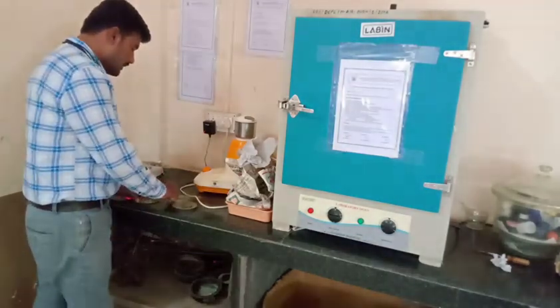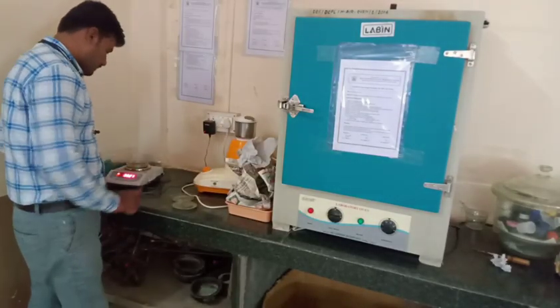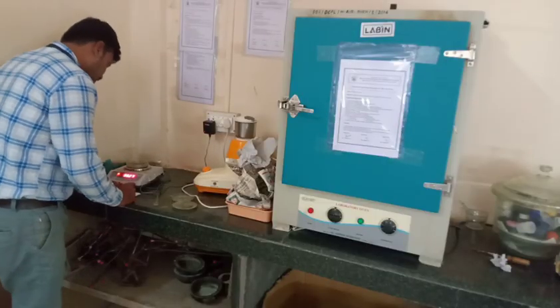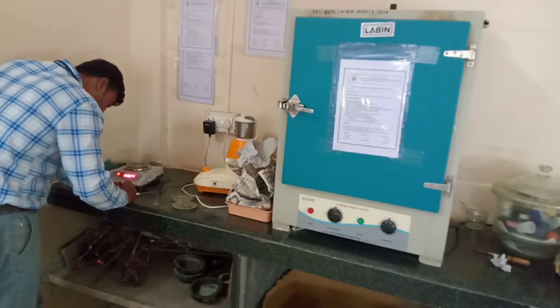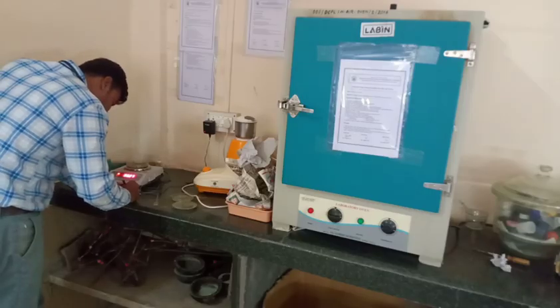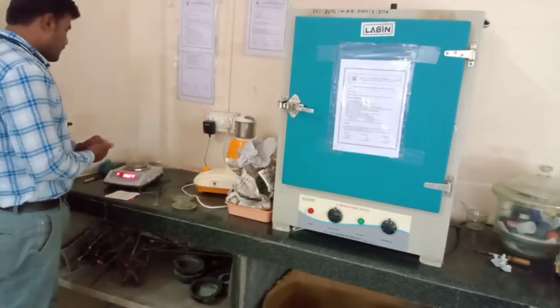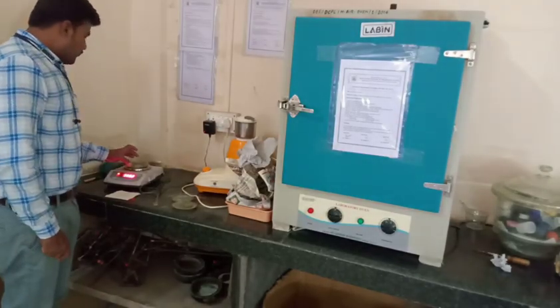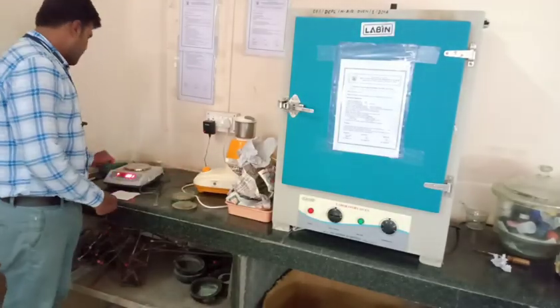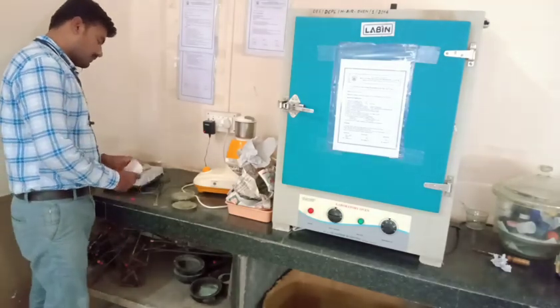Now we have to weigh the crude drug and note down the reading, that is around 55.22. So that is the decrease in weight of the crude drug after drying. It means there is a little amount of moisture present in that crude drug.